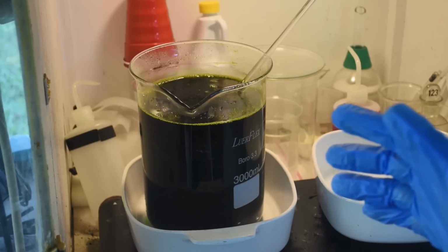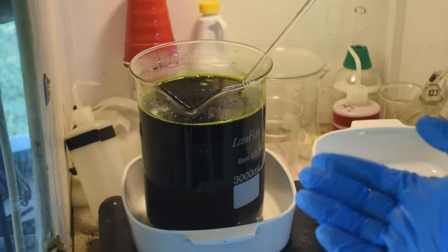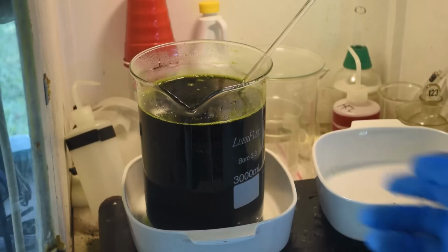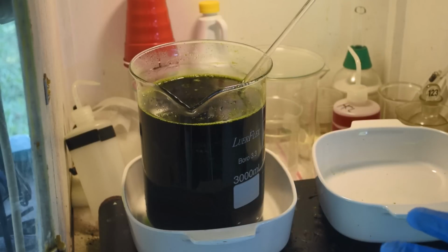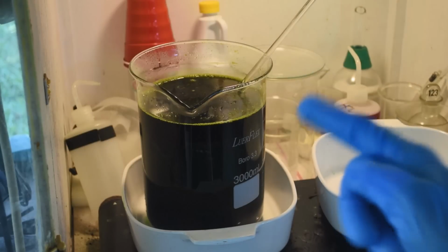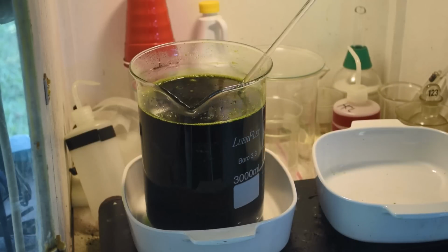Transfer some of the liquid to another beaker, maybe a tall beaker, and add some sulfamic acid to it to denox it. And then keep this up, just transferring some of it to the tall beaker and denoxing it until I get it all denoxed, and I'm left with nothing but some lumps in here and some denoxed liquid. So, the denoxed liquid would probably be pretty easy to deal with. Dealing with the lumps, well, I've got some ideas in that department, but we need to get there first, and we're still a long way from that.